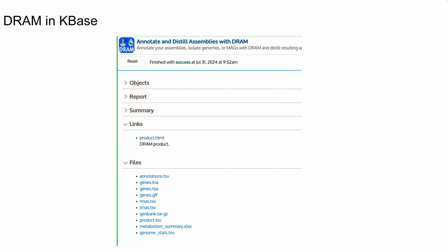And then in terms of functions that we are both really excited about, Jared has built a module. Do you want to talk about your methyl annotator? So I focus on methylotrophy, or metabolism of methylated compounds. Especially for the sake of trying to better annotate methanogenic physiological diversity, we're trying to include a methyl annotator. Those metabolisms aren't in databases. And another one that's really exciting is Bridget's, who built a module on polyphenolics. Again, she built the HMMs for that, which aren't in databases. And so that's something that's really exciting.